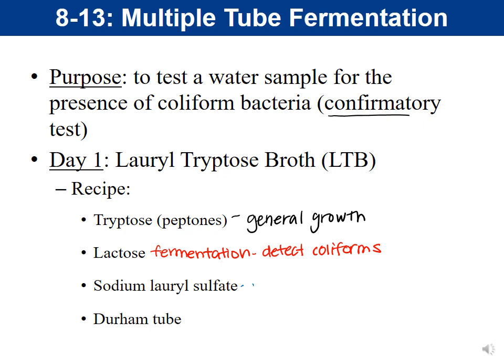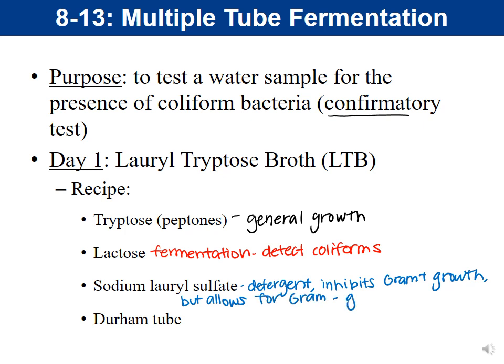It is a detergent, and its purpose in the media is that it inhibits gram-positive growth, but allows for gram-negative growth.